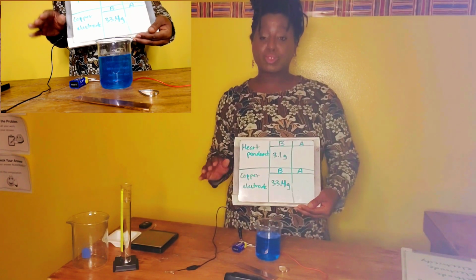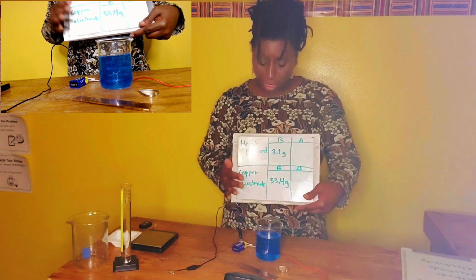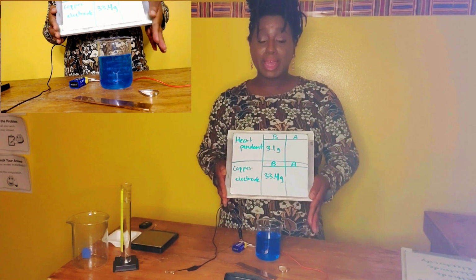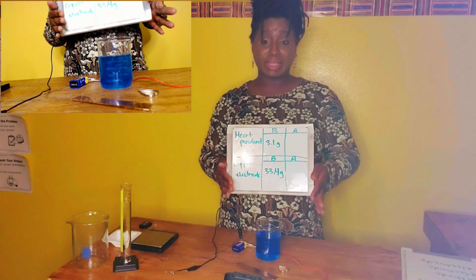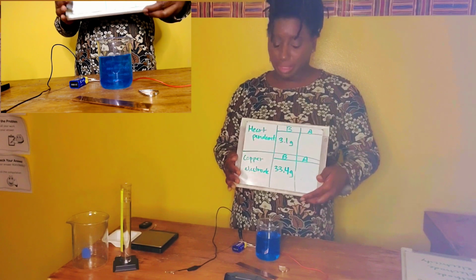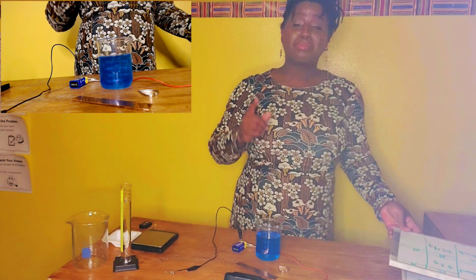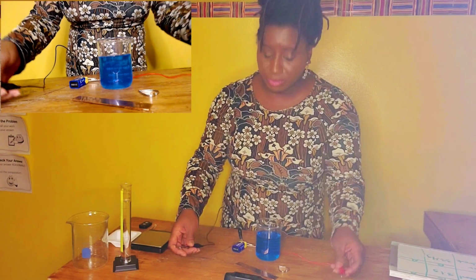But what we're gonna do, we're gonna up the challenge in this lab today. We're not only going to electroplate copper onto the heart-shaped pendant, but we're going to observe a change in mass. So we have recorded the mass of the heart-shaped pendant, which is 3.1 grams. And we have also determined the mass of the copper electrode to be 33.4 grams. So I want you guys to take a few seconds and make a hypothesis on what you think the change in mass will be. Which one of these will decrease and which one of these will increase in mass? Absolutely. Post your answers in the comment section. So now we're going to continue with our lab.